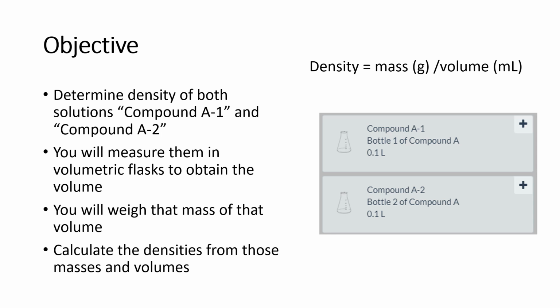I'm going to leave it up to you to read the premise behind this experiment, but let's say you were in a situation where you needed to identify two different solutions that looked the same, like they were both clear and transparent, but you needed to know which one was which. You would determine the density, and it's actually very easy. So that's what you'll be doing for this experiment. You're going to be determining the density for compound A1 and compound A2.